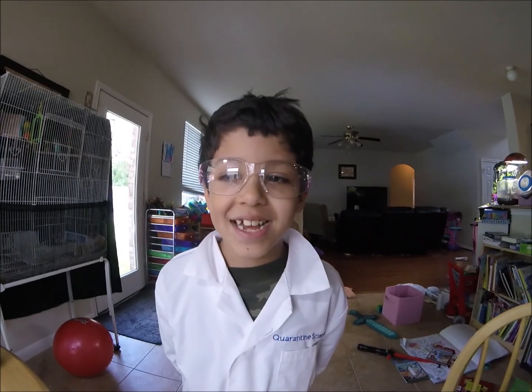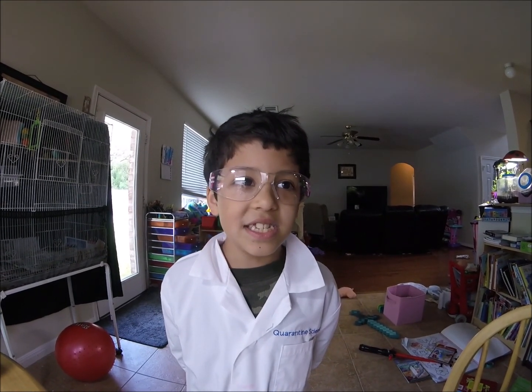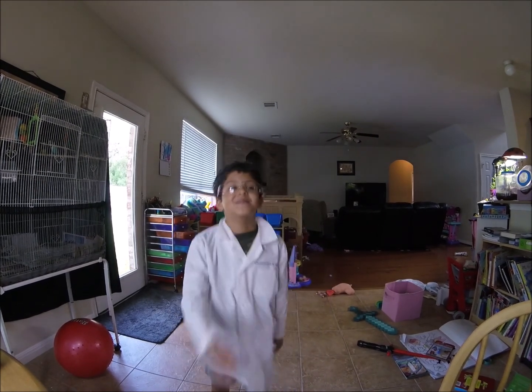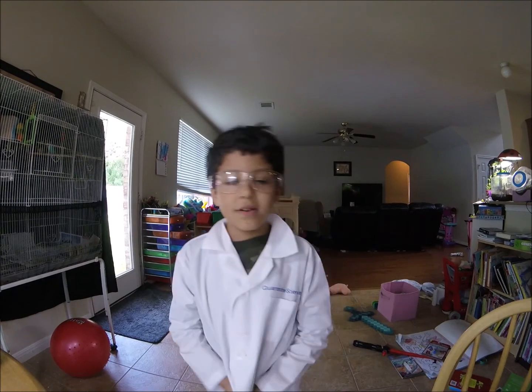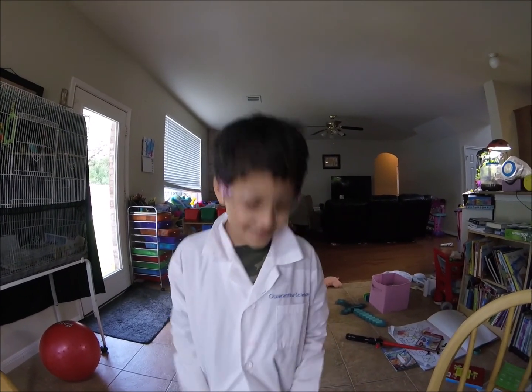Welcome to Quarantine Science Lab. Today we are going to get magnesium carbonate from magnesium sulfate and sodium carbonate.